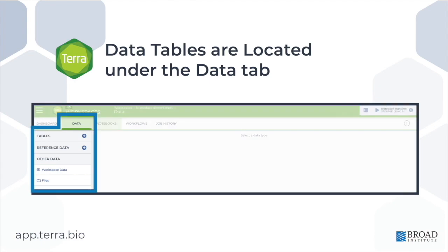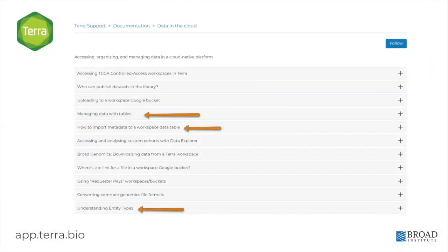You can import metadata here by pressing the plus button and uploading a tab-separated values, or TSV format spreadsheet. Before we do this, let's take a few minutes to familiarize ourselves with the types of data tables used by Terra.